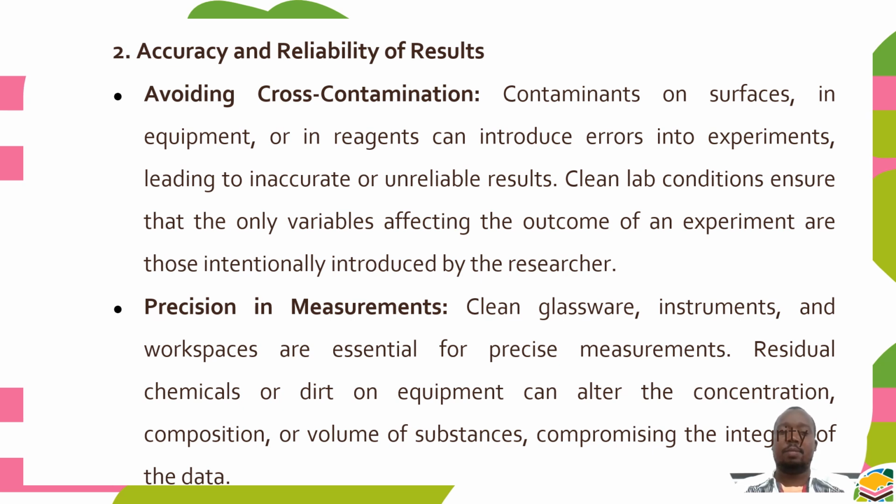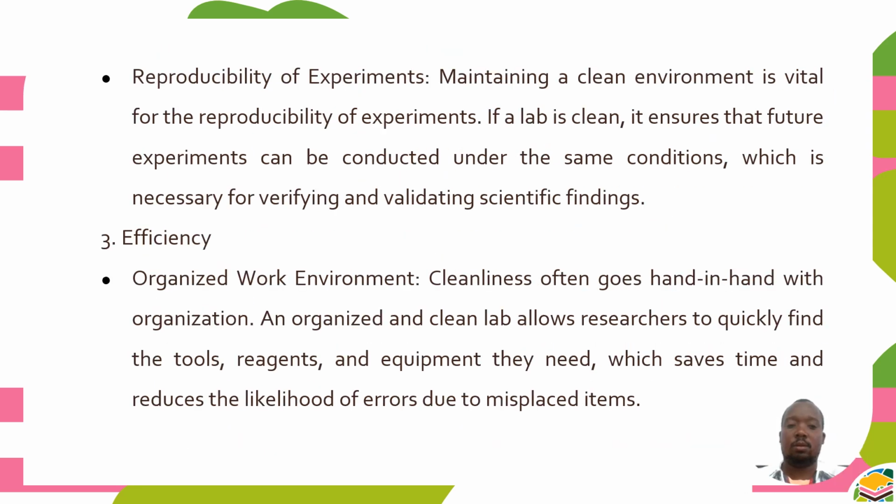Then precision in measurements. Clean glassware, instruments, and workspaces are essential for precise measurements. Residual chemicals or dirt on equipment can alter the concentration, composition, or even the volume of substances, compromising the integrity of the data. Then the reproducibility of experiments.